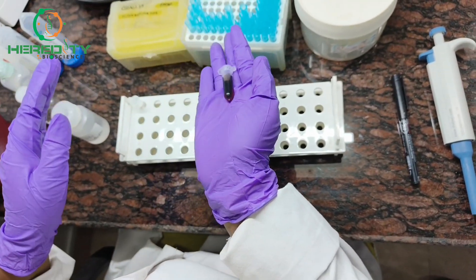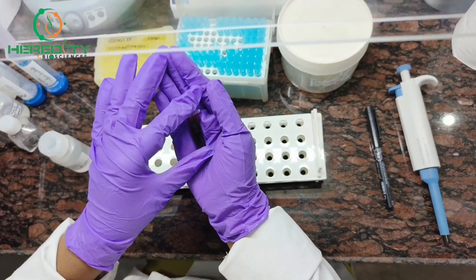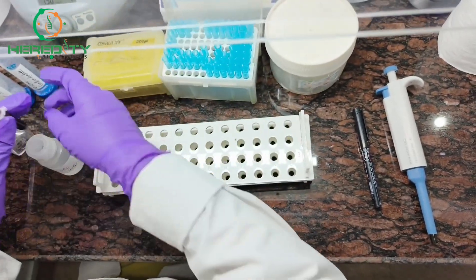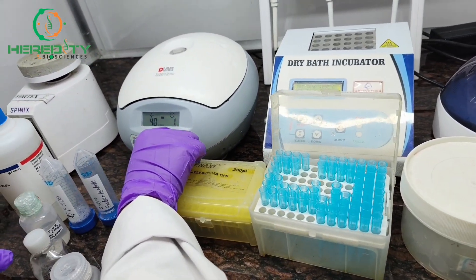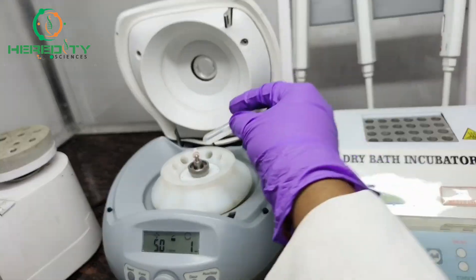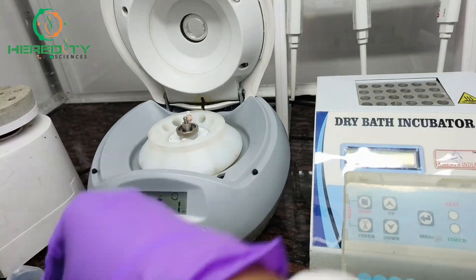Gently invert the tube. Now we will centrifuge it at 5000 rpm for 5 minutes. Here I am putting another microcentrifuge tube of equal volume to balance the centrifuge.